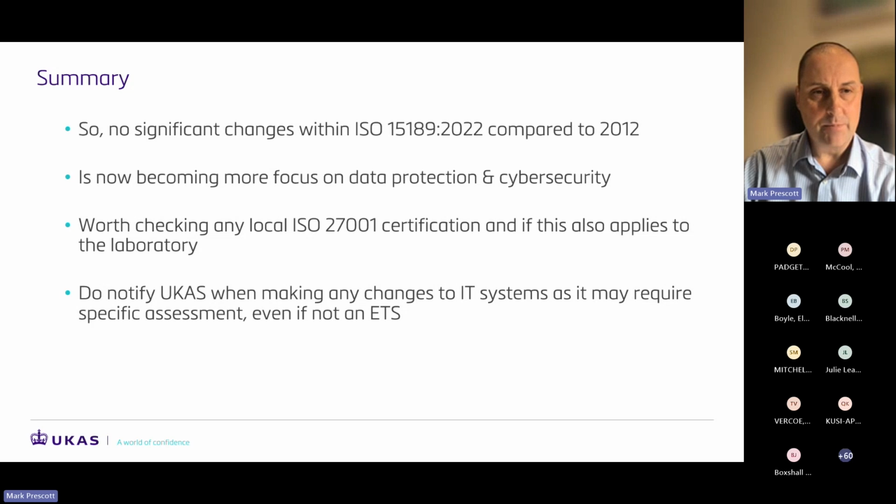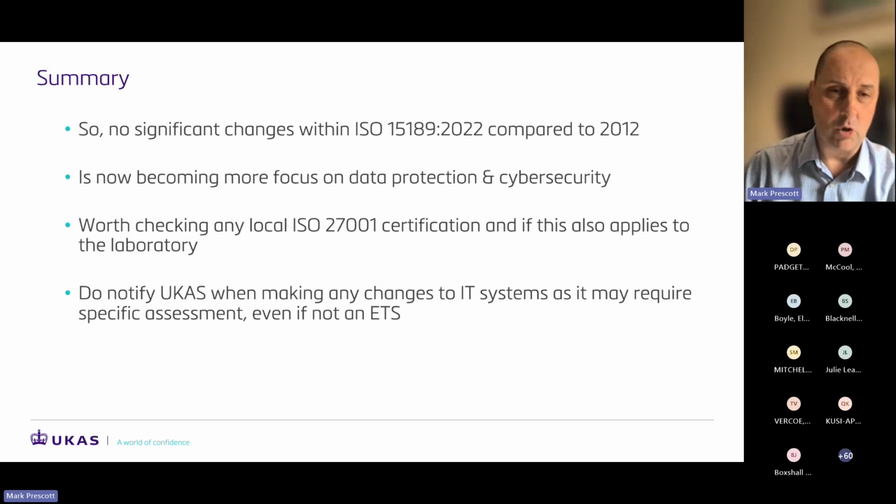It may not be an ETS specifically, but you may have updated a system, in which case we'll think, okay, next time we come on site, we'll make sure that we look at IT. We'll generally do it once in the cycle, data management, but we could move it to an earlier assessment if you've made a specific change. But certainly, I would imagine that for a new IT system, we will probably do that, not necessarily as an ETS, but there will probably need to be some dedicated effort for us to look at that, because it will require a review of some possibly quite lengthy verification reports.